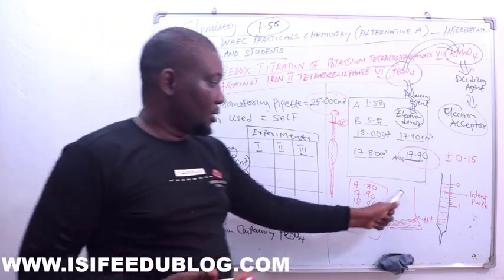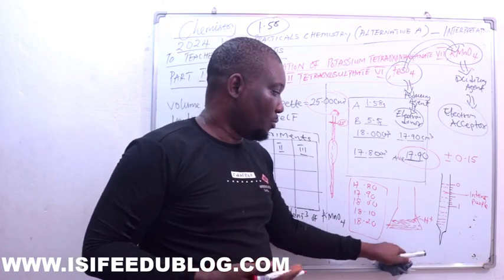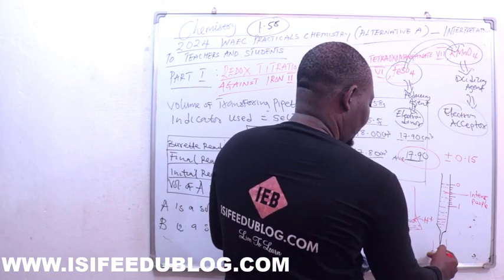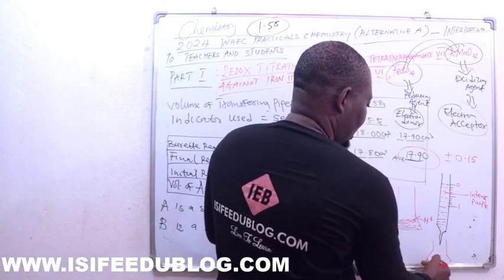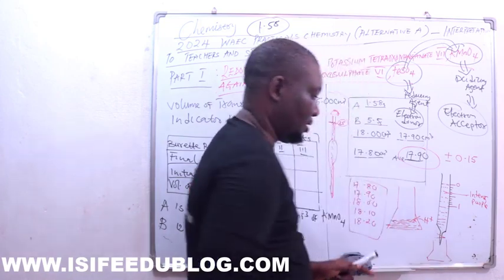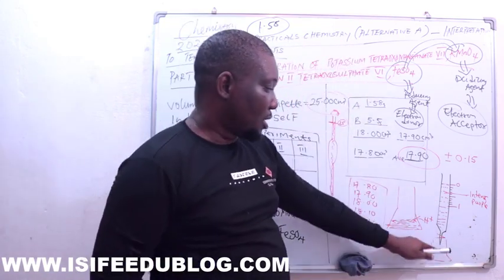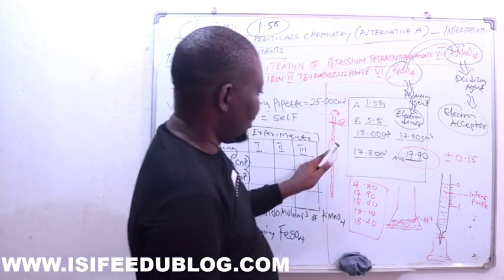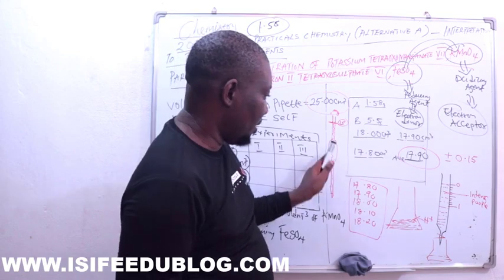Okay, now this is already the titration setup, in which this is now fixed here, and the clip or whatever is here will allow it to gradually mix with whatever we have in that iron solution, so that we now measure the volume.